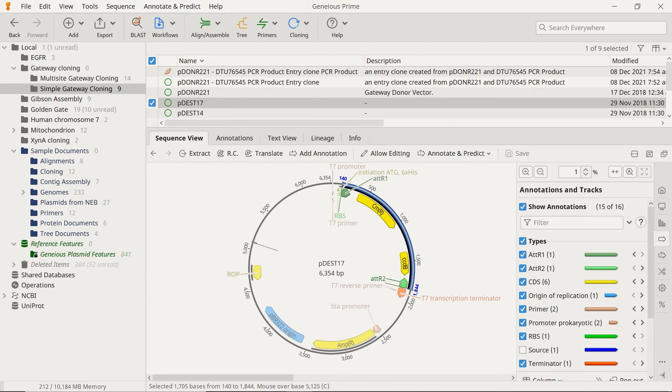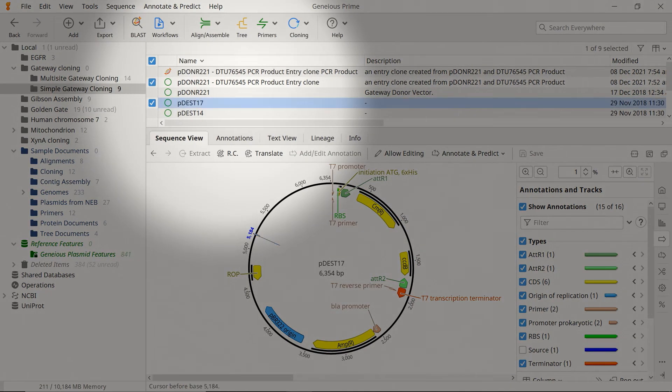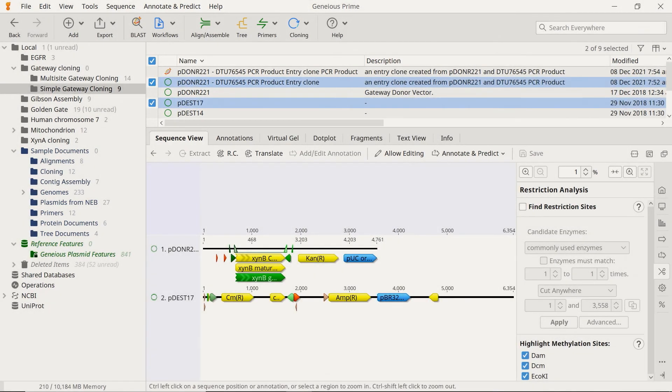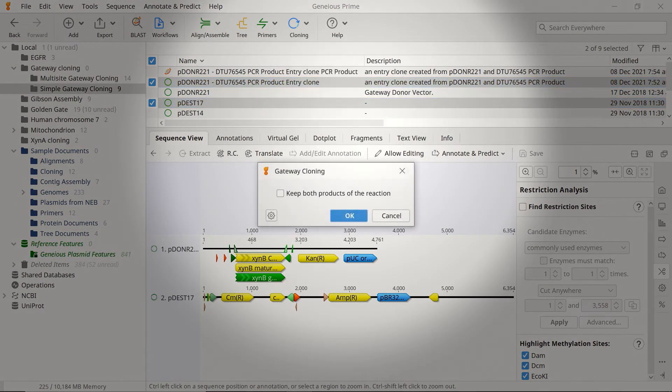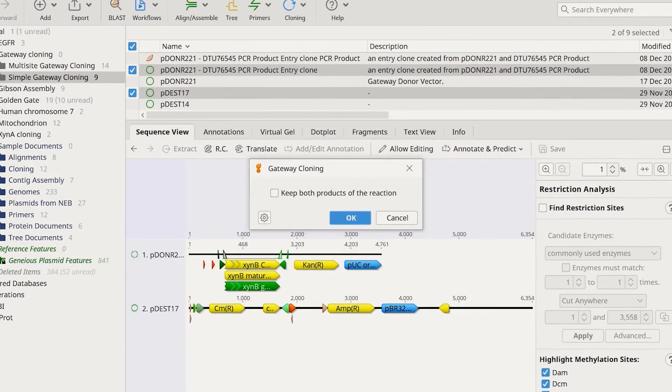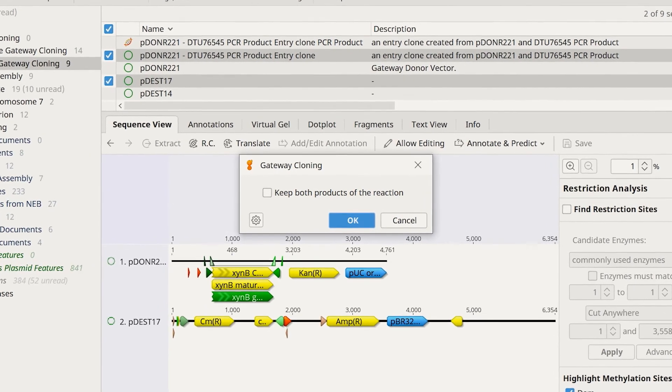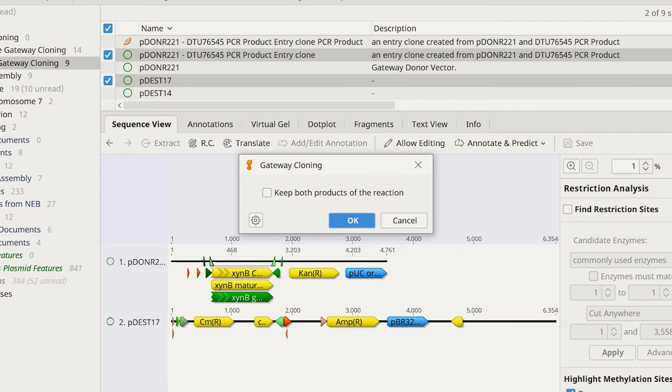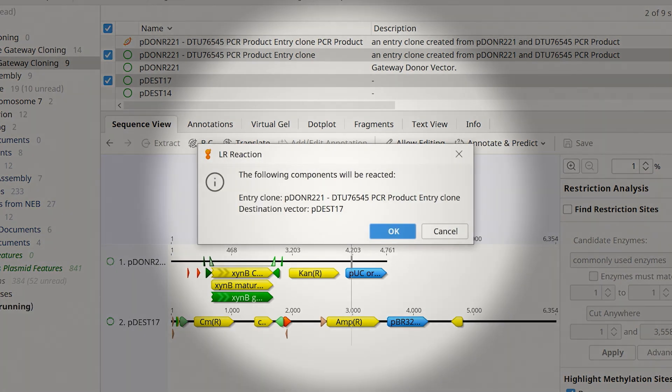To simulate the LR reaction, select the destination vector and the entry clone, then select Cloning and choose the Gateway Cloning option. Since the LR reaction creates two products, it is possible to save both sequences as separate files by ticking this option. I will leave this unchecked for this example and only return the final expression clone sequence.